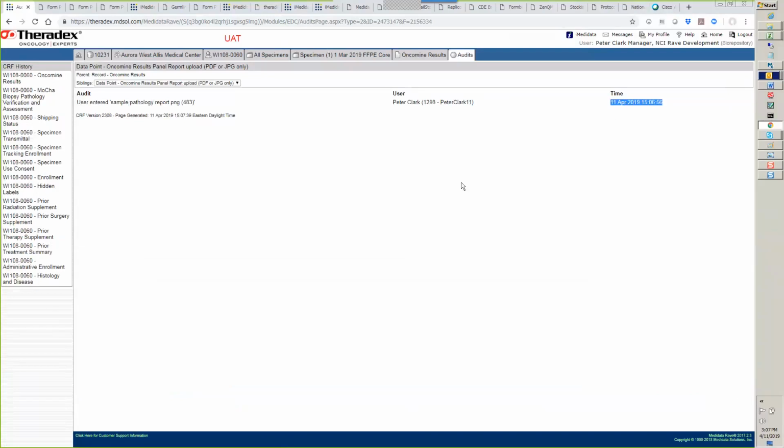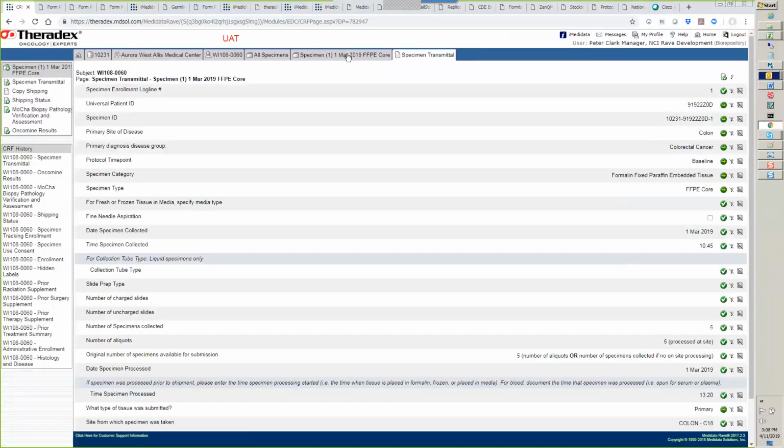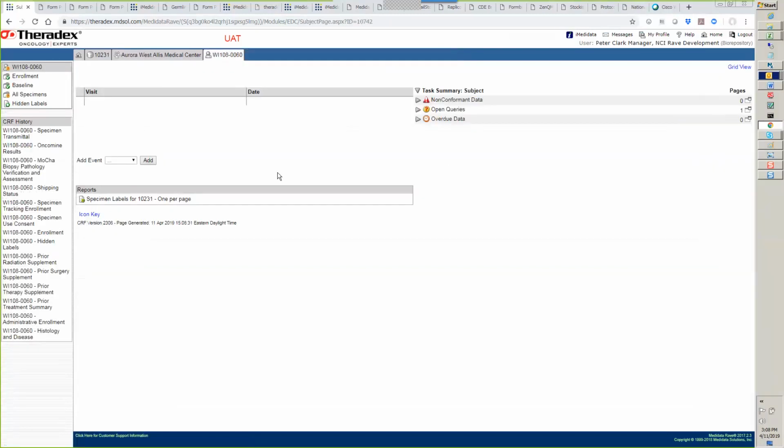Any other questions? So Peter, I have a question. Since you are working on the API, when you receive the sample, the receiving lab puts in whether it's acceptable and all these things. I also remember that you are working with Nationwide on a barcoding system, so you can scan the barcode and go directly to the sample page, so that people don't have to type in and search for that specific sample, and the process is done quickly. Is that something you're still working on?